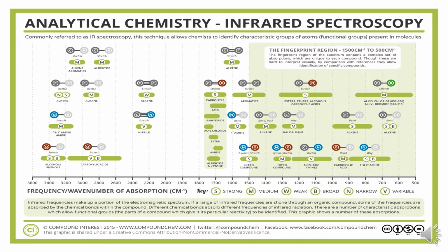Now, if I draw in our line for our first peak, which was about 3450 wave numbers, we'll see that that passes right through the alcohols range. Normally, we could assume that this definitely points out an alcohol. However, recall that an alcohol has a tongue-shaped fashion, as shown by the graphic a couple of slides ago. So, it's unlikely that we have an alcohol.